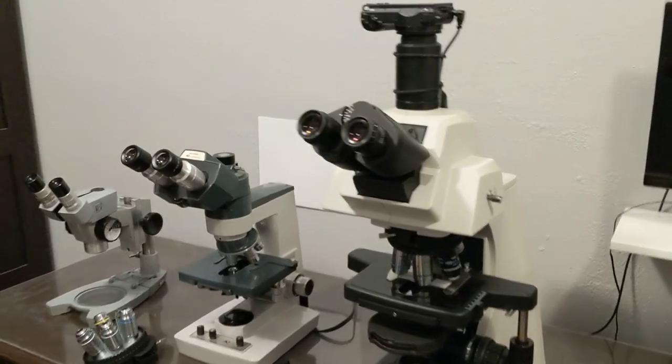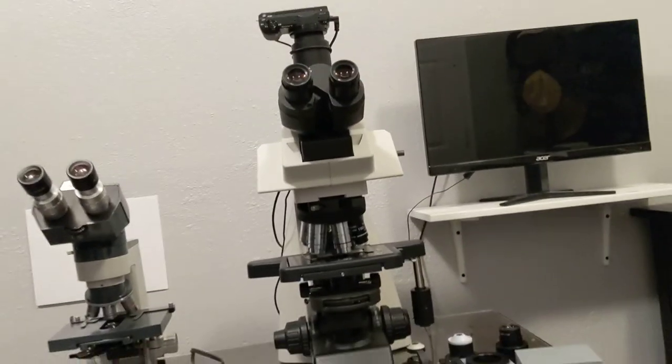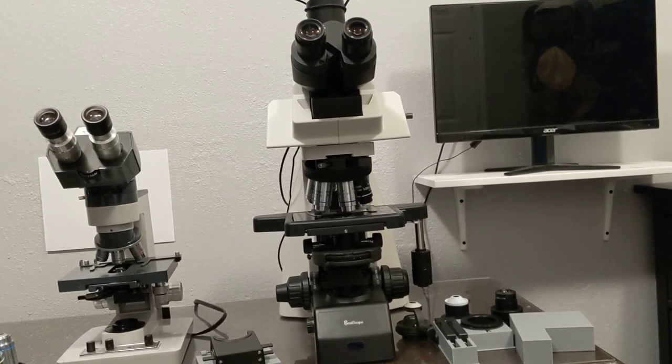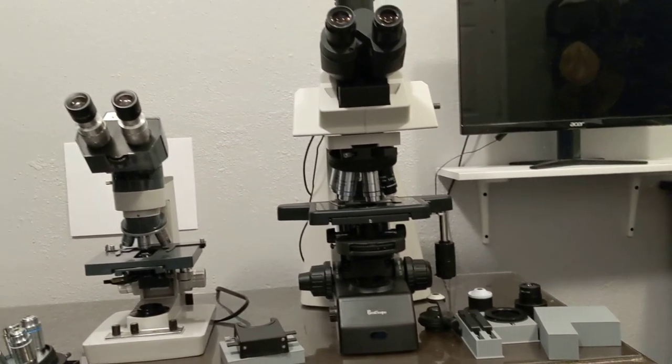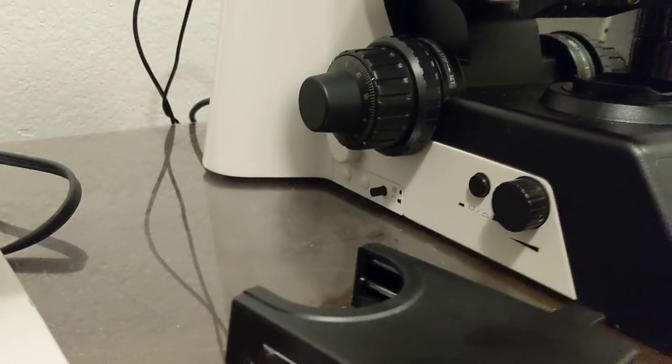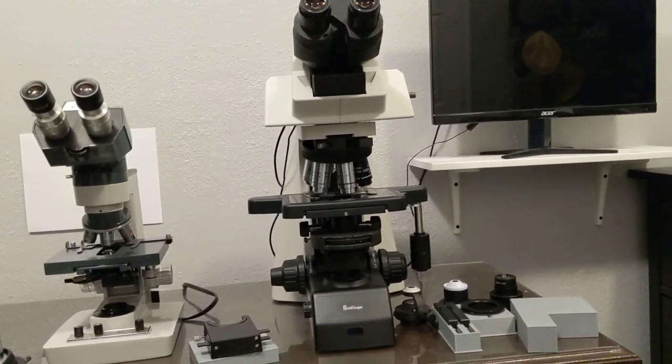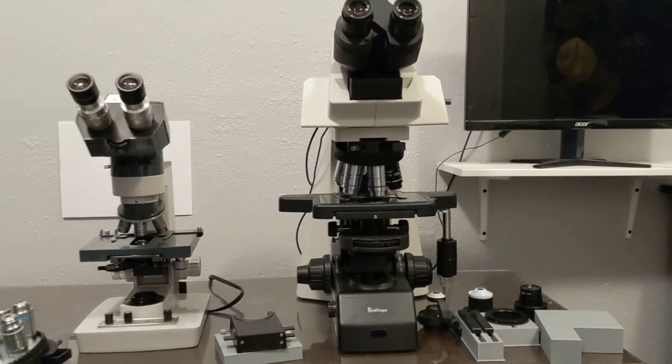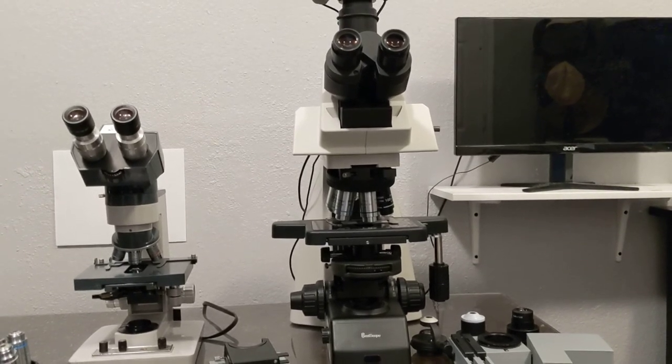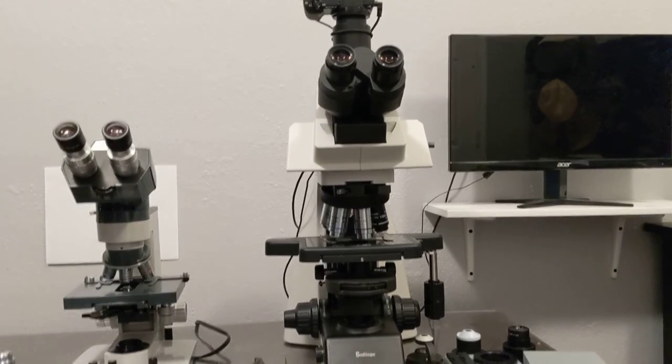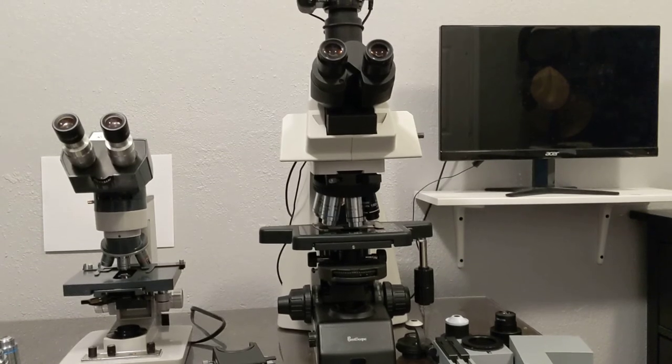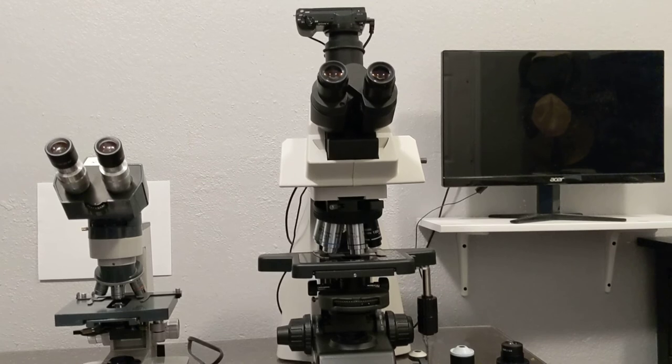Did I talk about the neutral density filters? That's one more complaint. When I talked to them, they said they've got these different neutral density filters that I can install in the microscope, and they're pretty expensive. I asked, can you have all those installed at once? And they said yes. There's a spot there for two more filters in the light path. But they weren't installed because there was just a miscommunication. They gave me these 45-millimeter neutral density filters that were really expensive, and I don't really have that much use for them. I wish that they were built into the microscope. That's my number one biggest complaint about the experience.